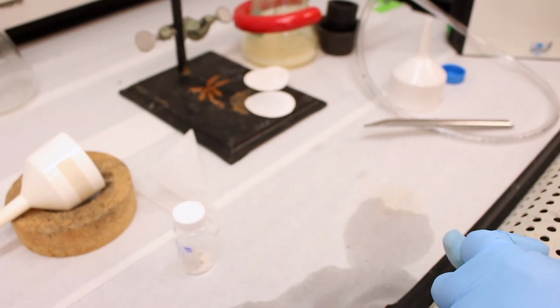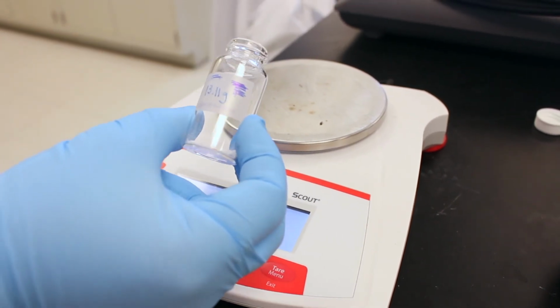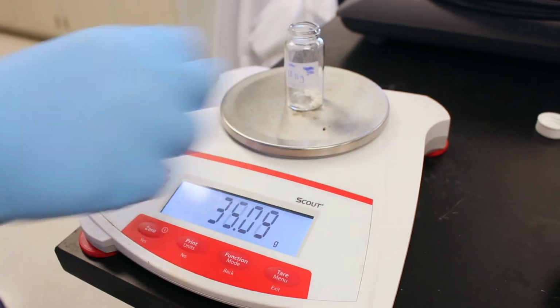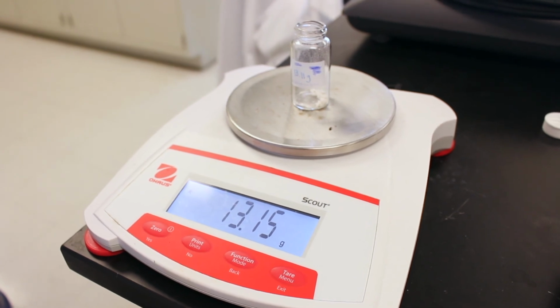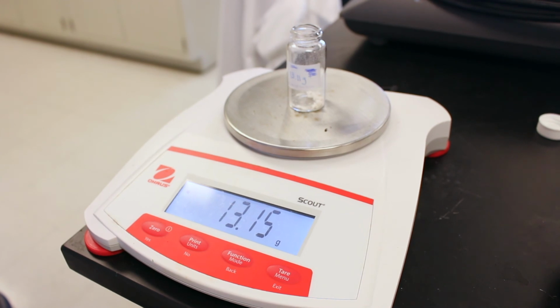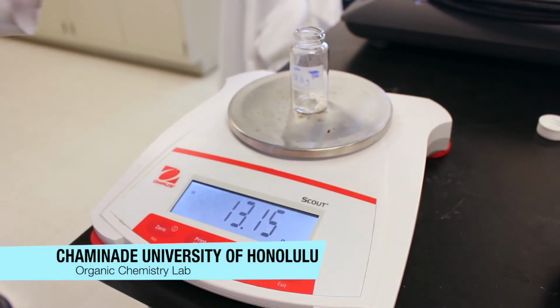Okay, see you then. So we've got our product here. It's a white solid, and it's been in the vacuum desiccator for about an hour. So now we'll place it on our balance to get a yield. So it looks like we have 13.15 minus 13.11. So it looks like we have 0.04 grams.